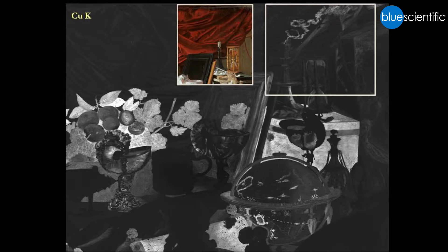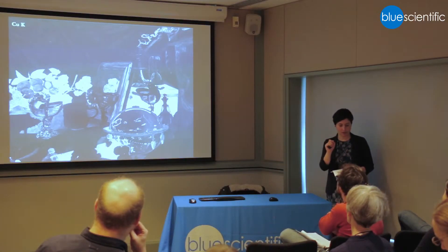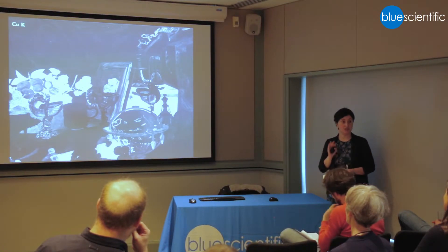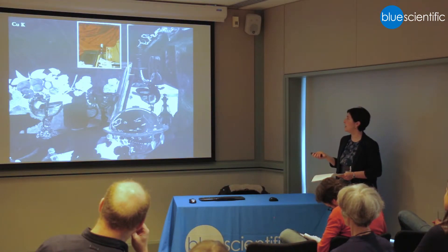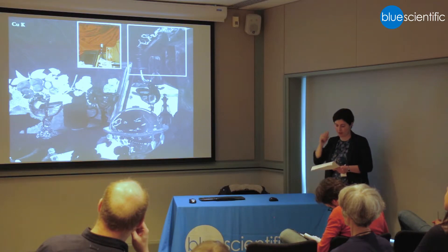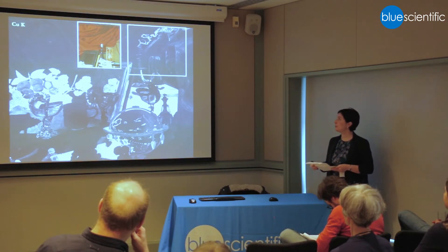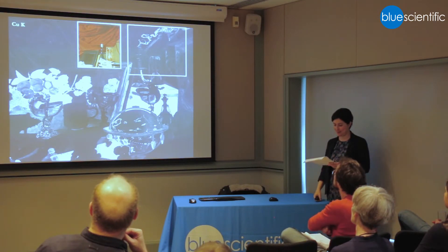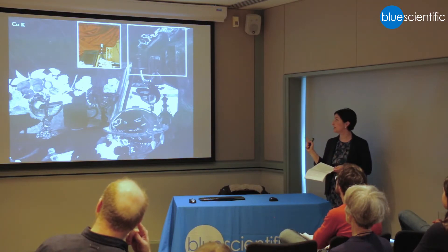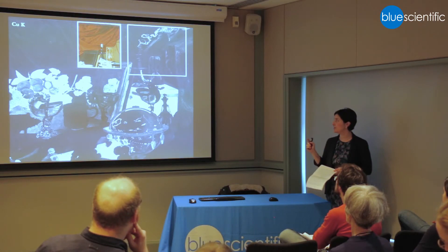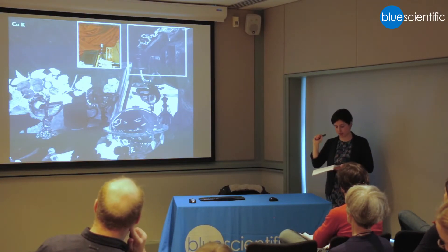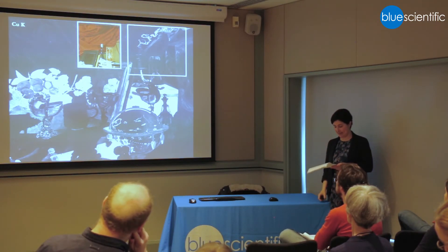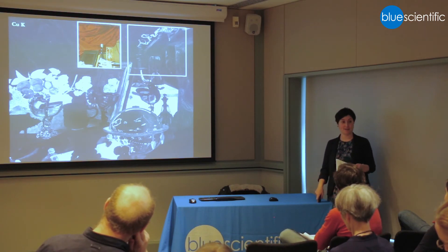This is the copper map. We find copper in green pigments, and copper was also used in low amounts as a siccative in oil paint. Despite the low amount typically found as a siccative, you can see it very clearly in the smoke coming out of the extinguished candle. The smoke was probably carbon black to which verdigris dissolved in oil was added as a siccative. Although hardly visible with the naked eye, this thin column of smoke is clearly identifiable in the elemental map. This is important because, together with the hourglass and the snuffed candle, it represents the passing of time — one of the central themes of the painting — which you can find more about in the exhibition next year.